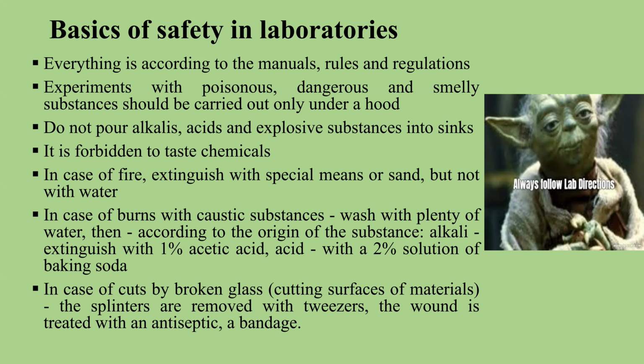If you have acid burns, use a 2% solution of baking soda, etc. And in case of broken glass, use forceps or tweezers for removing splinters from the wound and treat it with an antiseptic bandage, etc.